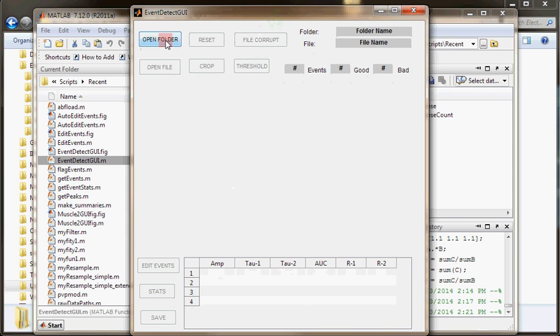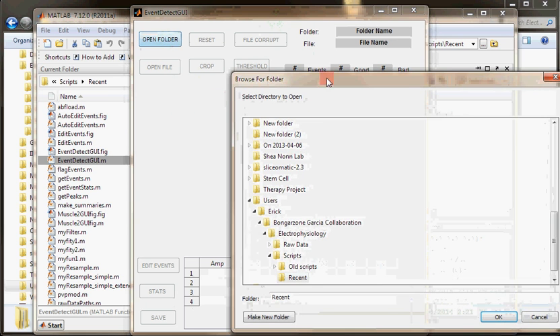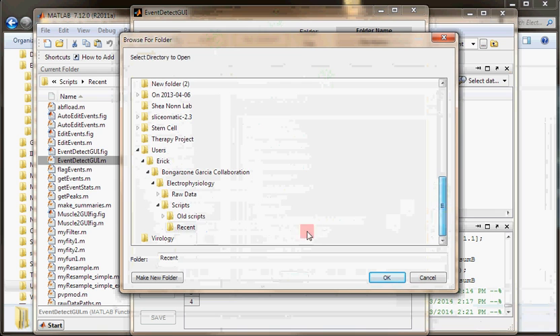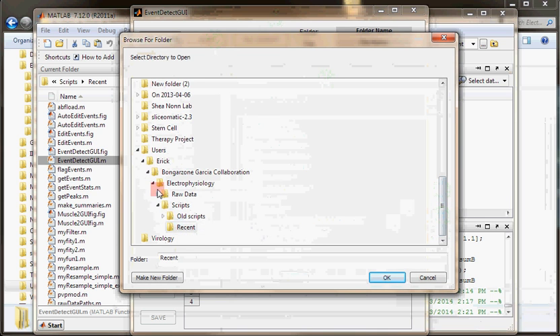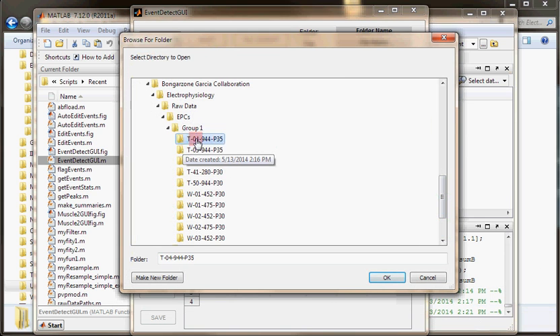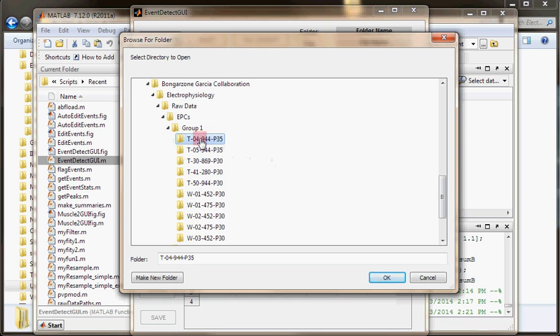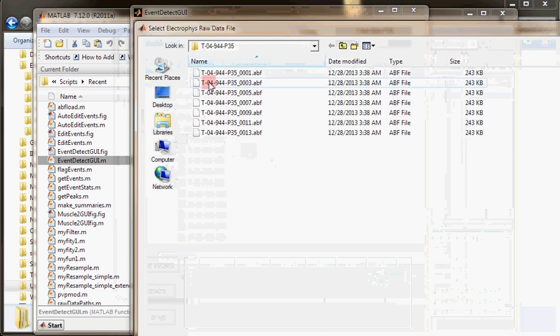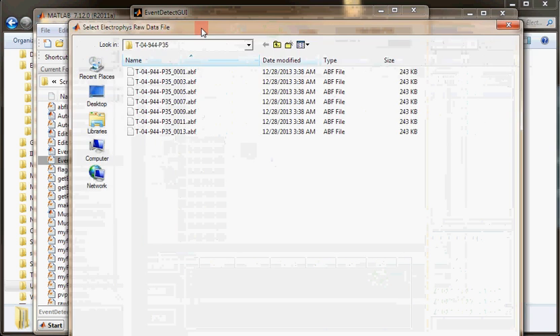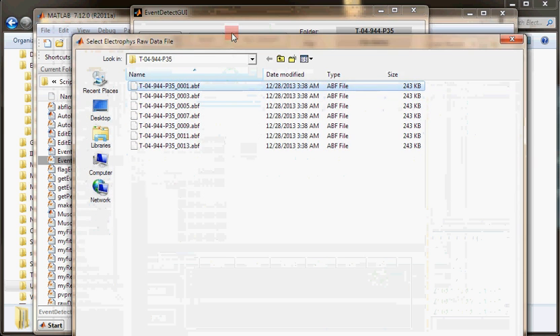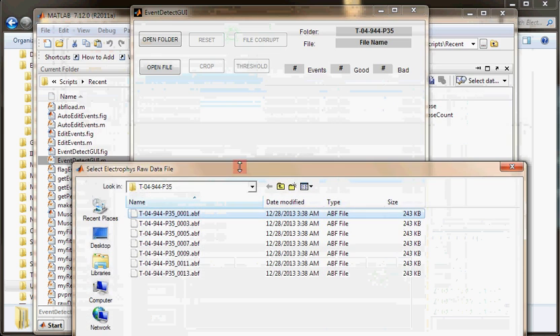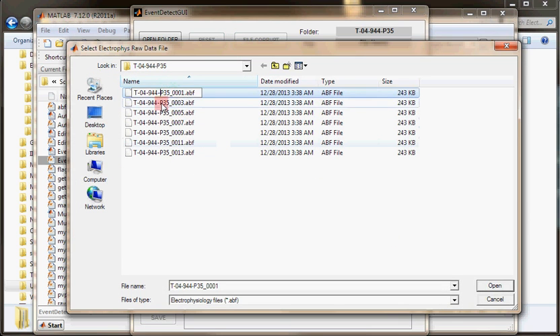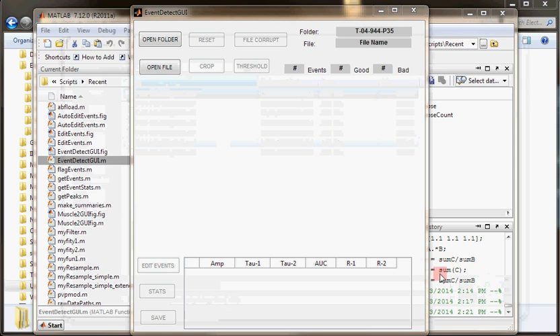What I'm going to do is click open folder. I'm going to find inside the raw data, the folder EPCs group1. I had deleted the .mat files inside this folder. So I'll select that folder, and then I'll select a file I want to analyze. I'll select the first one and open that.